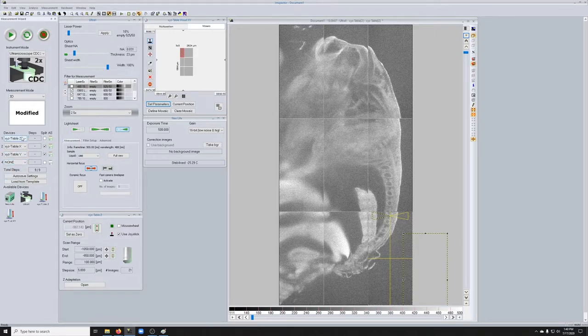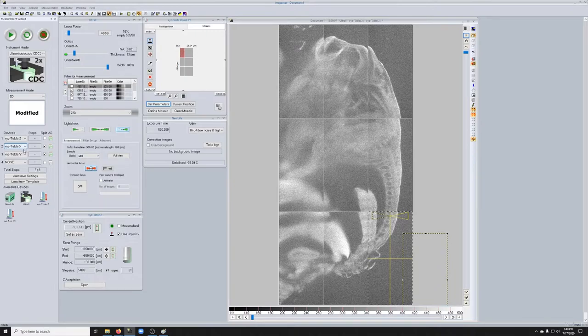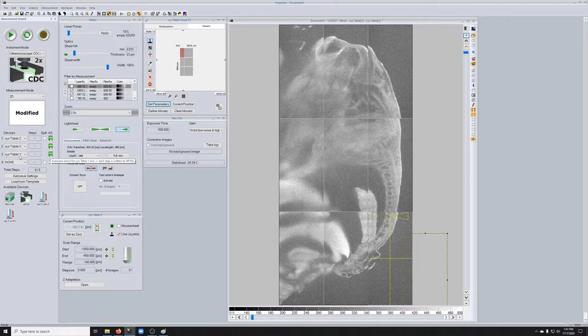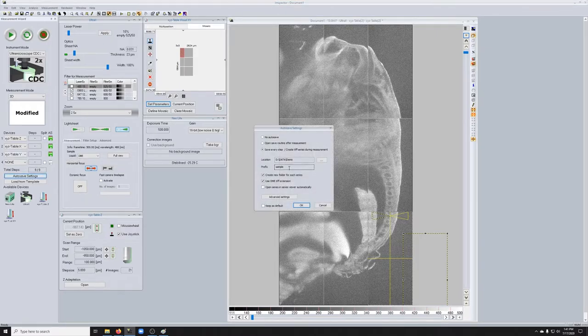So this tells it do a Z stack, then do the X positions, then the Y positions. And you want to click on auto save. So now we're ready to go. We just need to tell it where. I'll call the sample two.